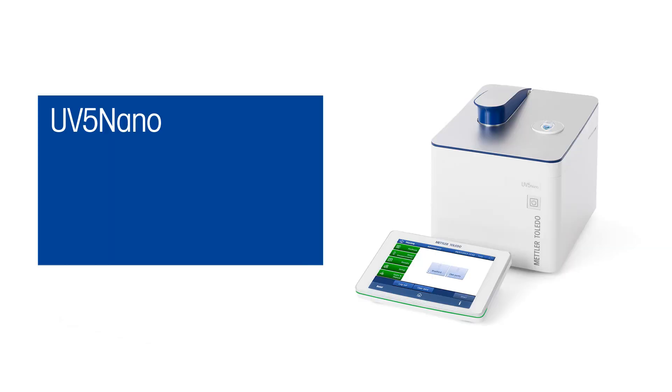Finally, the UV5 nano offers micro-volume measurements for life science, lock-path technology for accurate path length, and double application power.